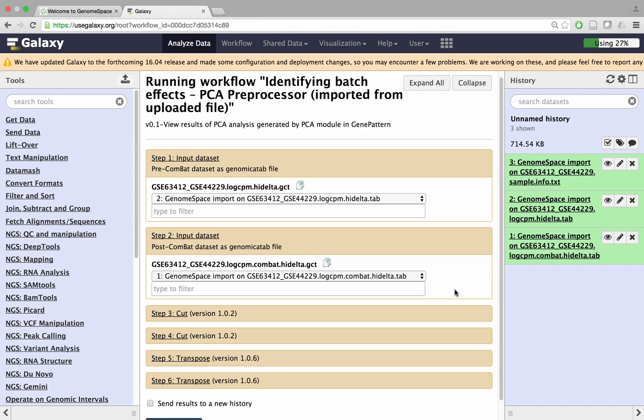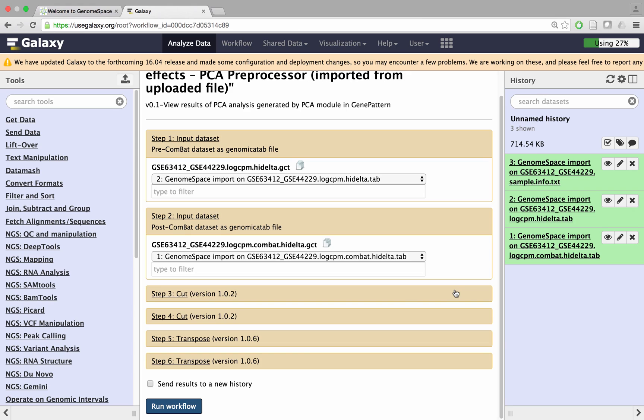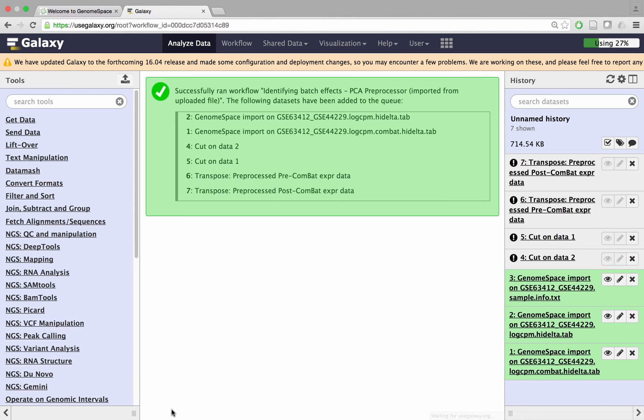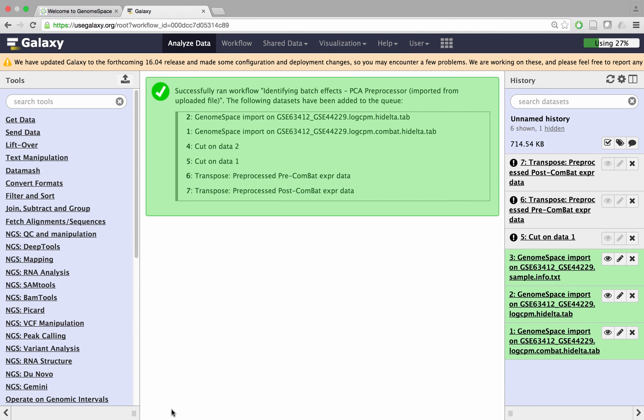Once you have set all the input datasets and parameters, click Run workflow to launch it. The various steps of the workflow will be loaded as pending jobs in your history.